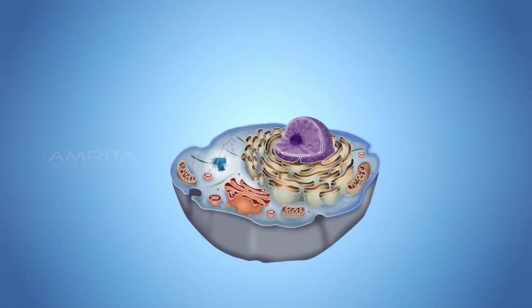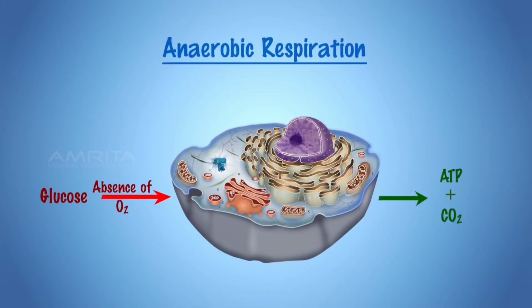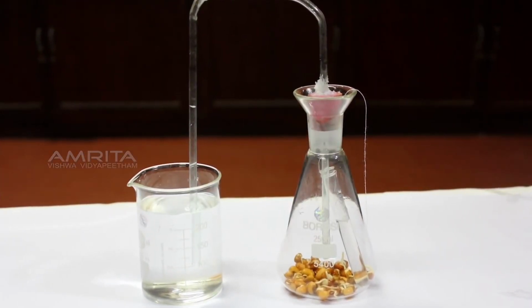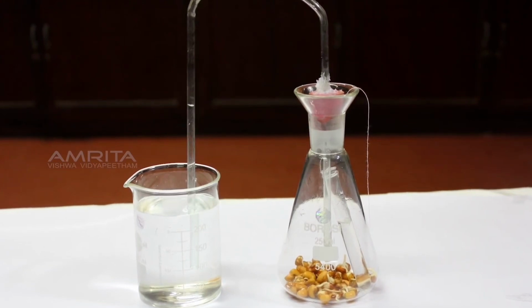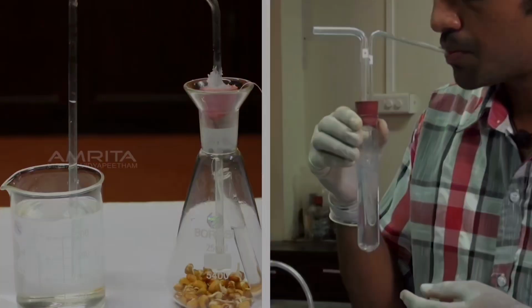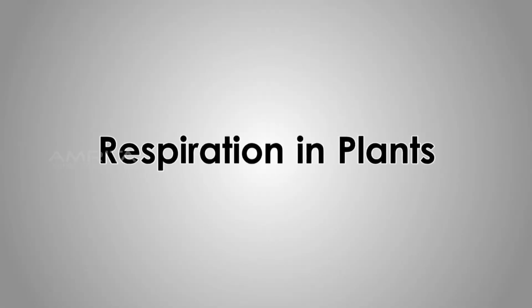The respiration that does not require molecular oxygen is called anaerobic respiration. This process occurs in the cytoplasm of the cells. In this experiment, we shall look at the release of carbon dioxide gas during aerobic respiration by plants and human beings. Respiration in plants.